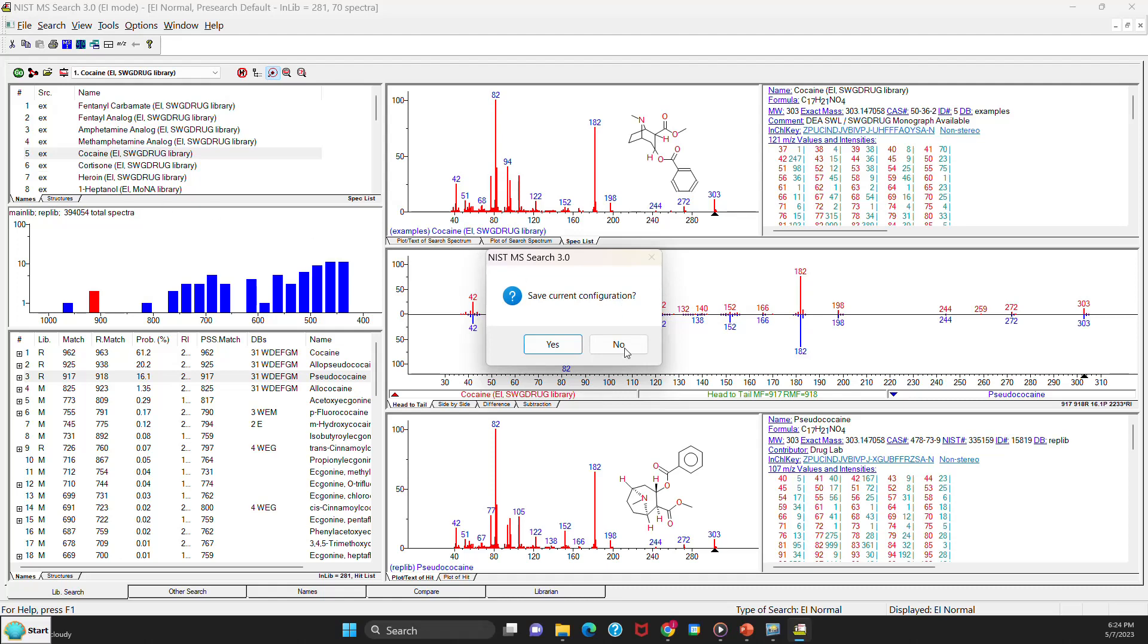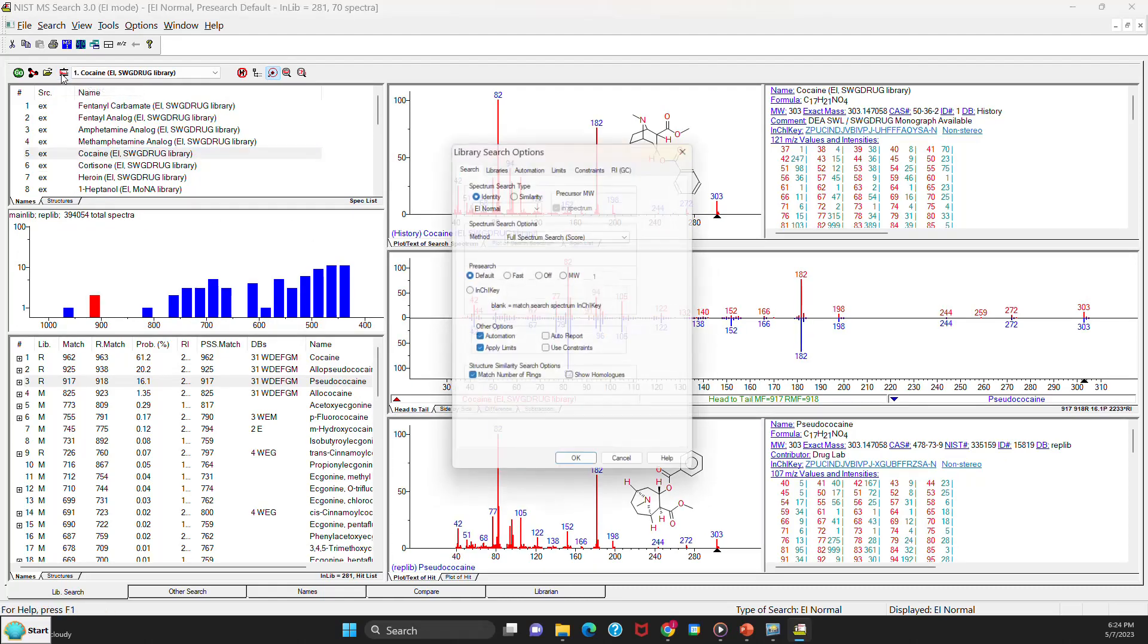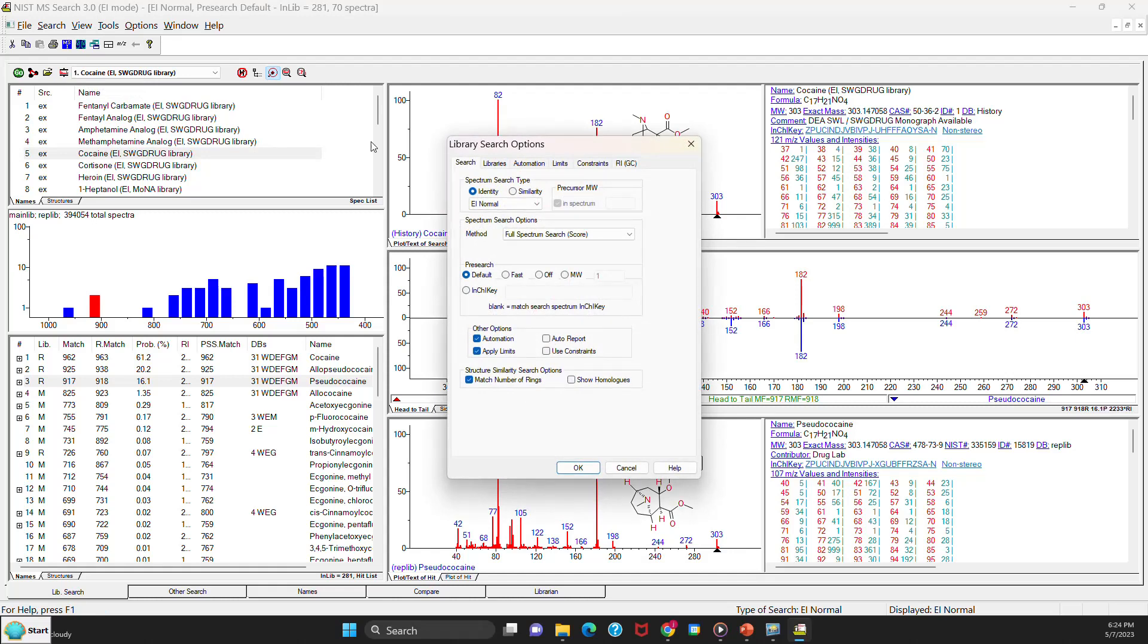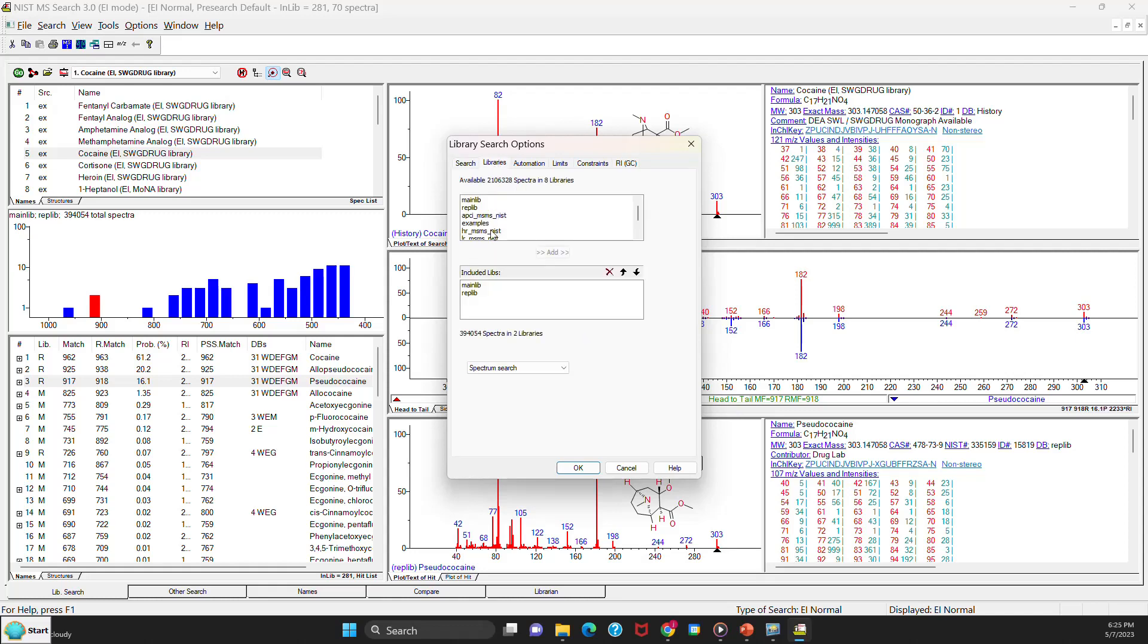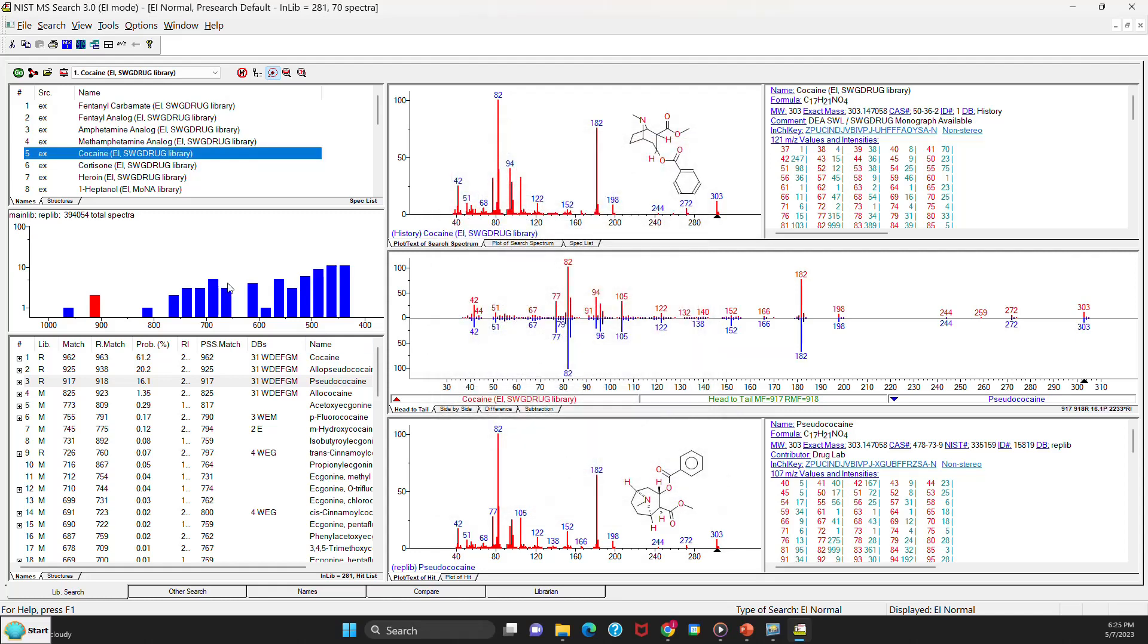Save the current configuration. Let's don't. We'll come up to the library search options and we'll just see what we have. It's going to do an EI search, the normal full spectrum search. All the settings look pretty good in the method. If you go to the libraries, you'll see that it's picked the appropriate libraries for doing EI searches, the main lib, the rep lib. It even picks the right ones for doing the structure search. So all of that looks good. So we're okay. We're ready to start our search. So we've got cocaine selected, spectrum number five in the list. And we'll say go to start the search.